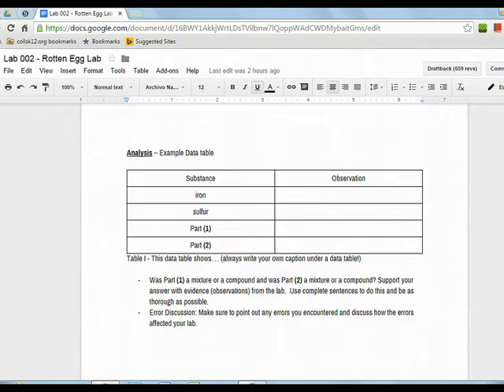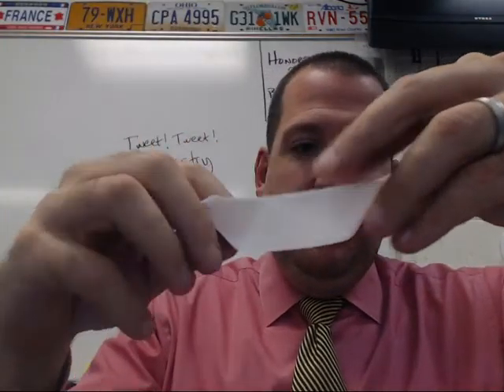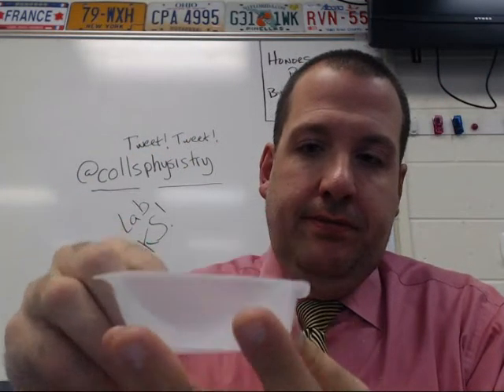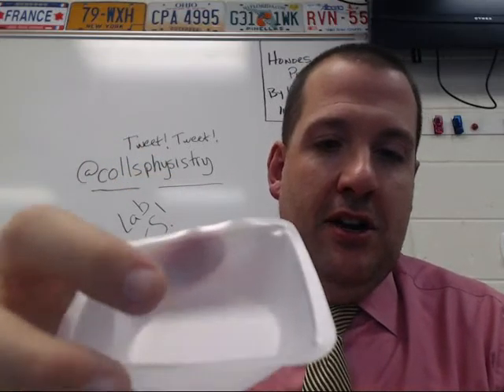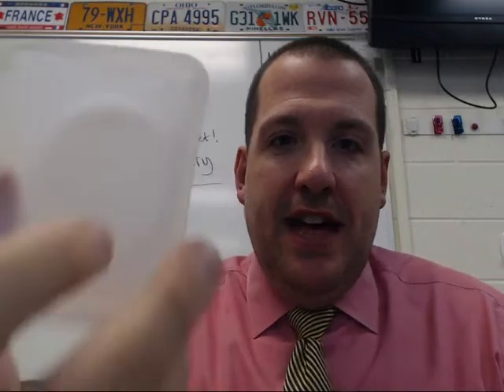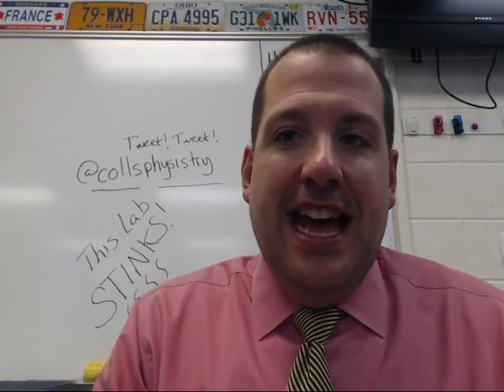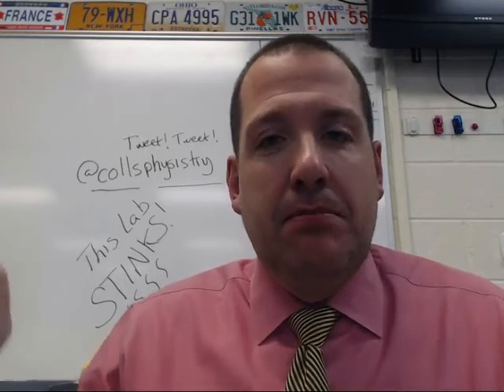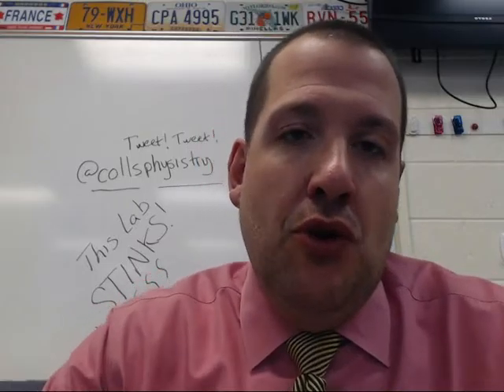The whole point is if we're exploring mixtures and compounds, you want to know if that thing that you mixed in part 1 was a mixture or compound. That whole combination of sulfur and iron here. Okay, you want to see if that was a mixture or compound, and then afterwards, after you heat it up and put it in the water, you want to see if that little glob of stuff is a mixture or a compound.